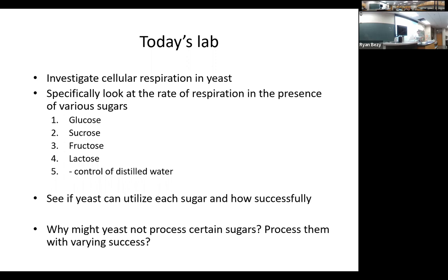Okay, and there will be a little bit of respiration even in the water control. Sometimes when the yeast doesn't have anything to eat, they start cannibalizing their proteins. They break apart their proteins, eat them as a source of amino acids to keep their energy processing going. That only lasts for a while, but it's long enough that we'll still see some background rate of respiration. That's going to be considered our not respiring control. Okay, you'll still see a little bit, but that's what it is. Questions about that?